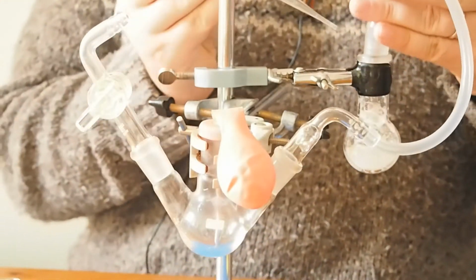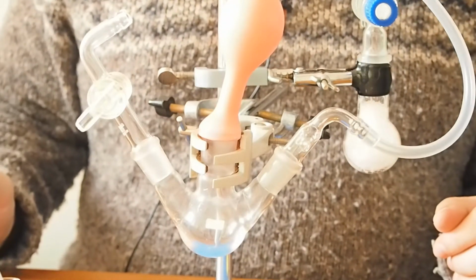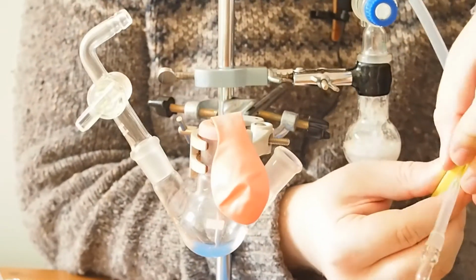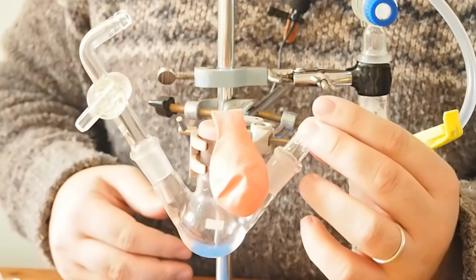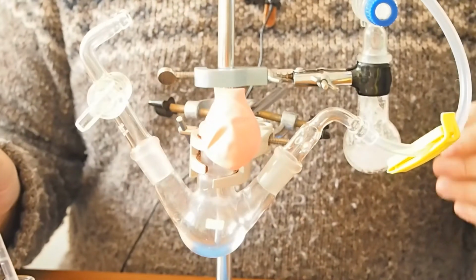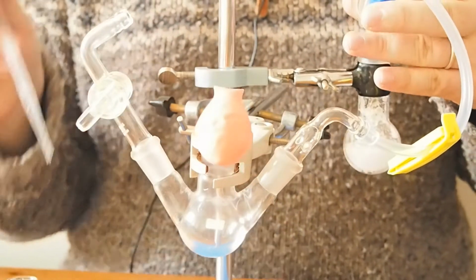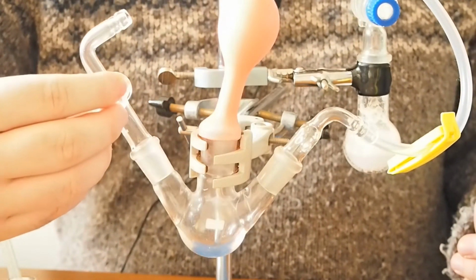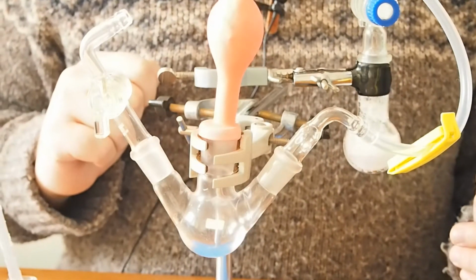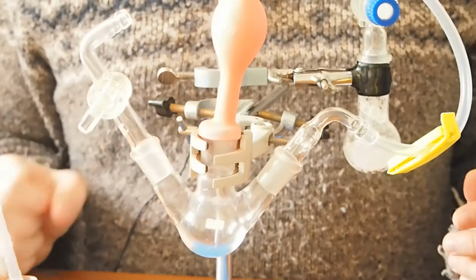Now if I close that valve and fill this up, our balloon's going to fill up. It's got nowhere else to go now. So if we put a little clip on here, oh, it's pushed it out. That's something I need to improve as well. I need to put some clips on here. There's plenty of improvements to make with this system. Now you can see that there is still a slight flow, but it's much more controlled if I have the clip on. And then to stop it pushing out the valve, I can have it slightly open here. Oh, let's close that off now. We can see it's holding it really nicely.